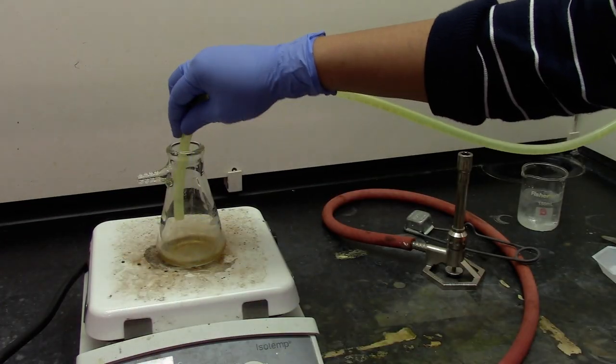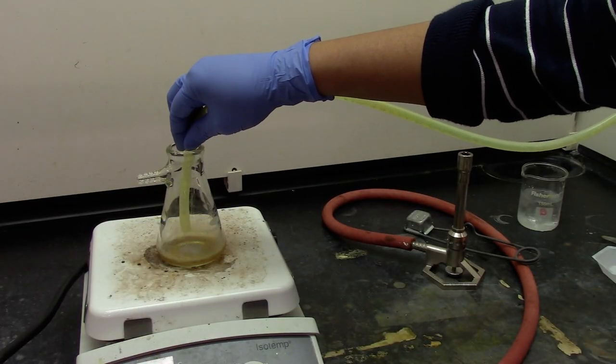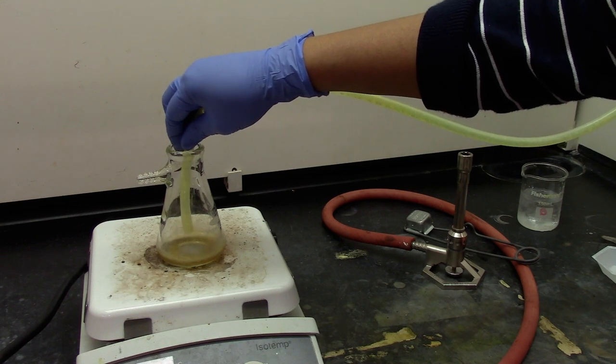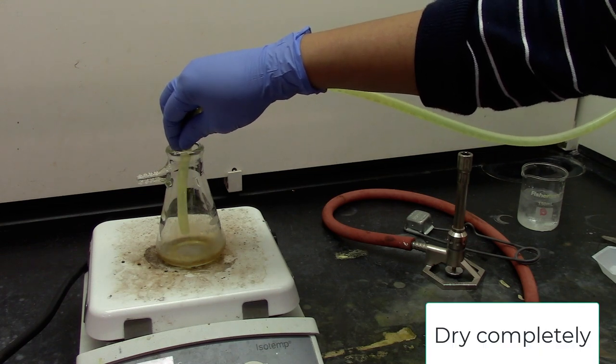Put the Erlenmeyer flask on a hot plate at around 80 to 85 degrees Celsius and blow air on top to dry it completely.